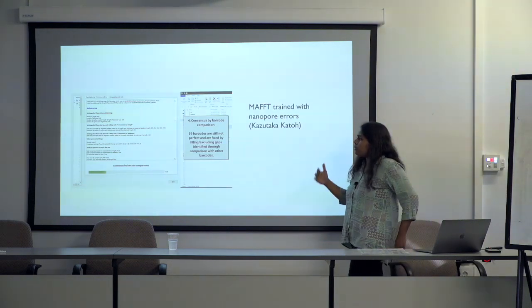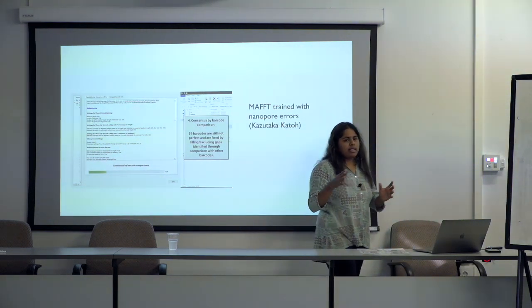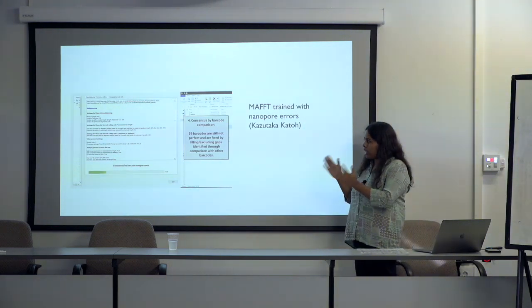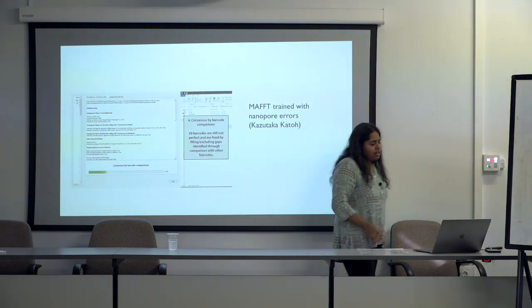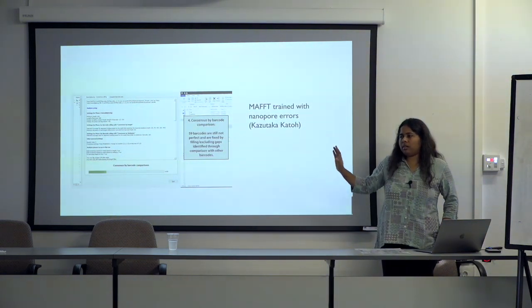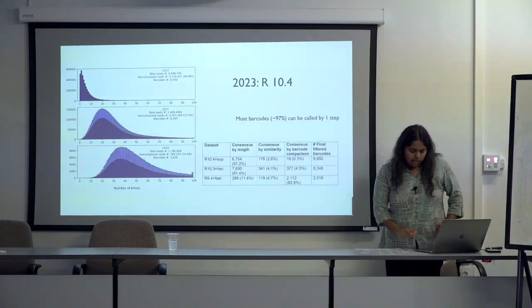So the final stage is really to look at whether there are indels being created in the alignments that you're getting from these barcodes, and fixing those indels based on an MSA. This is something you can turn off. This is the last step, and it's becoming quite unnecessary in the recent runs.